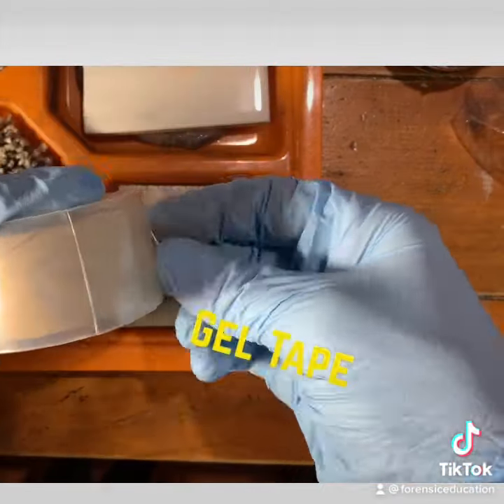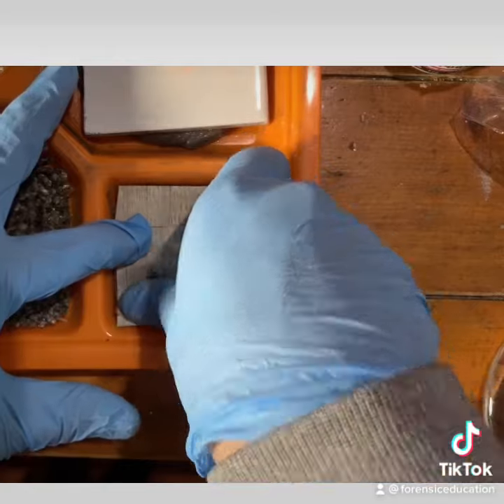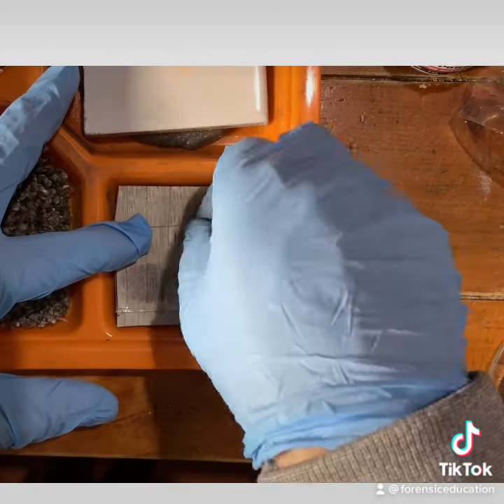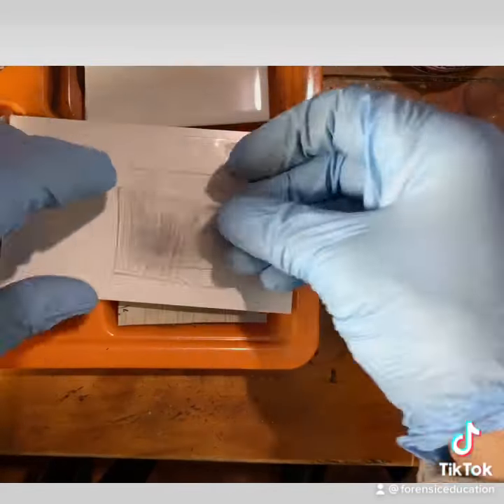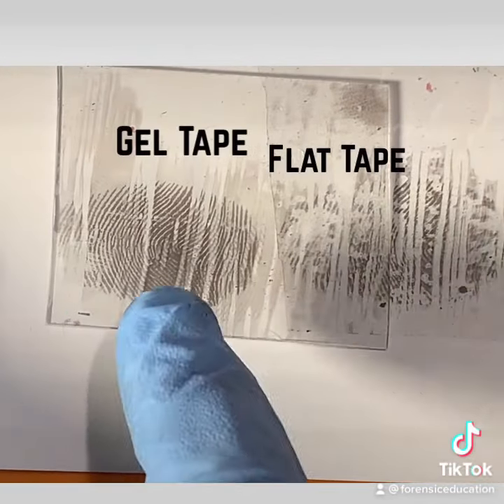Now let's look at using a gel tape. It's a little thicker. Let's put that on there. Now we're going to pull that up. Watch the difference with this detail — using the gel tape, it gets in the nicks and grooves. Oh, beautiful.